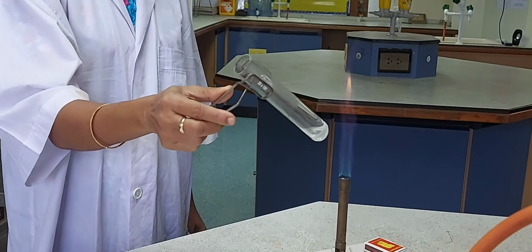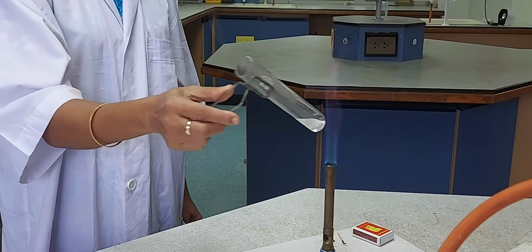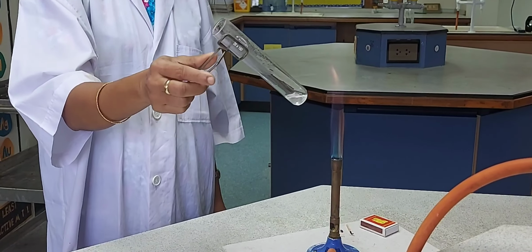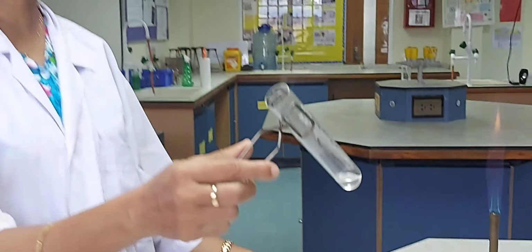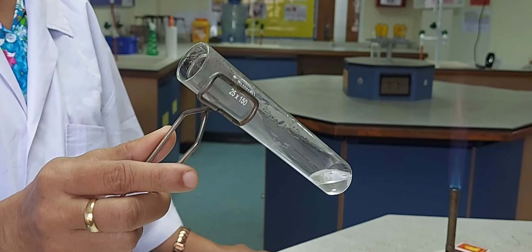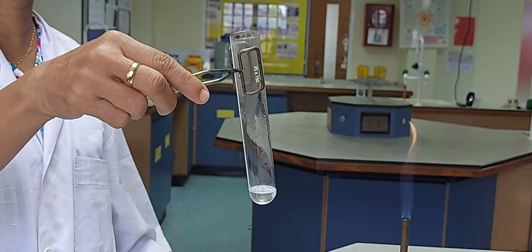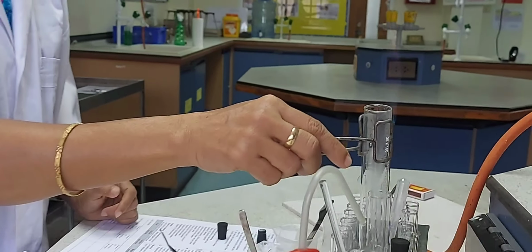Okay, so you can see some sort of fumes being given out, definitely fumes of water vapor, and the sodium hydroxide has dissolved or completely reacted with the acid. The reaction between sodium hydroxide and hydrochloric acid will not give any significant change in the solution, but we know that it will react, giving out the water vapor which is coming out, and sodium chloride will be left behind.